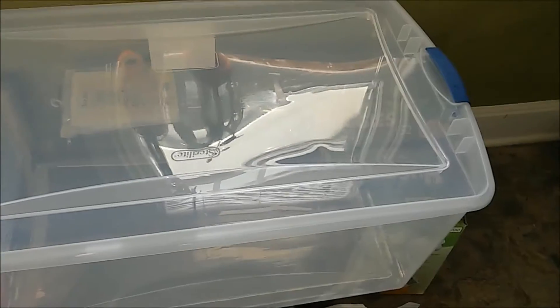Today we are making our glove box. You're just going to need a clear tote that you can see through, one that's big enough for you to do any of your work in, whether you're doing grain to grain transfers or you're just inoculating agar in petri dishes.